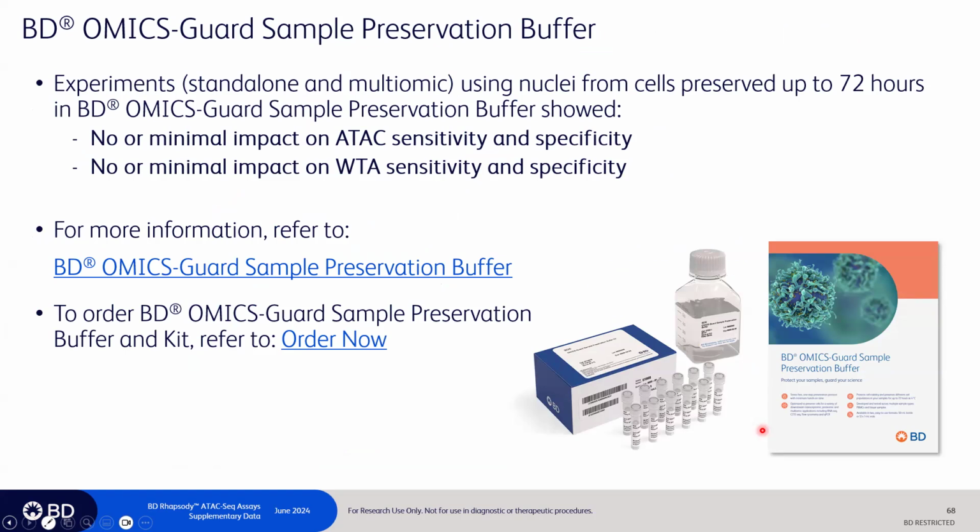So this has been really great for some of my groups who, like I said, have these clinical samples or a ton of mouse samples that they need to process, and it allows us to do your processing day 1 and maybe come in and do your partitioning day 2 and break up the workflow a bit so that no one is in the lab until 1 in the morning.